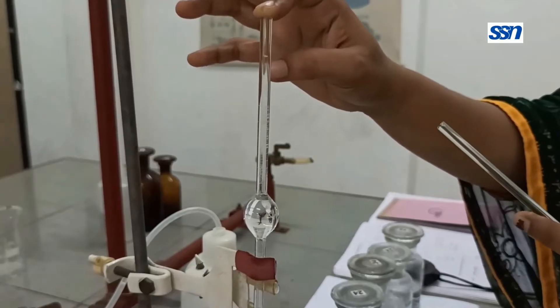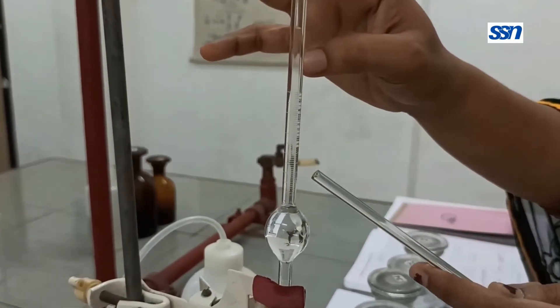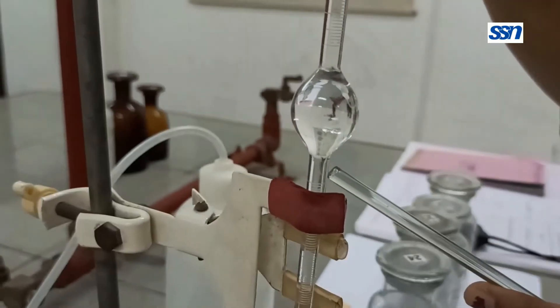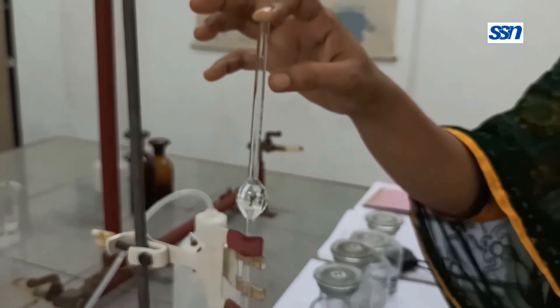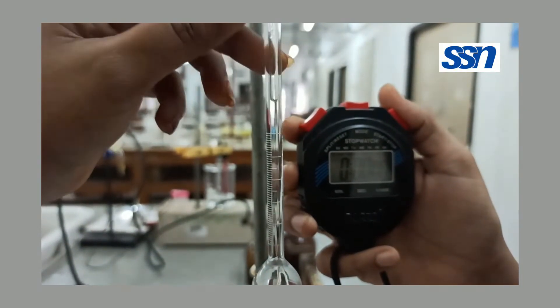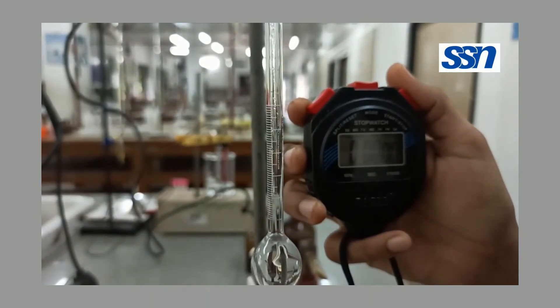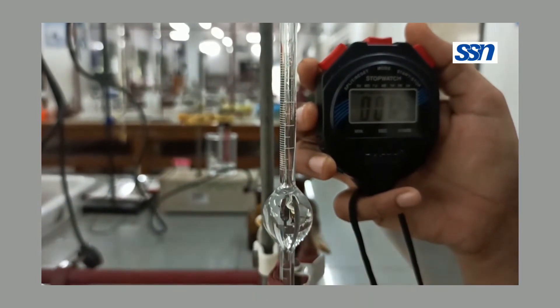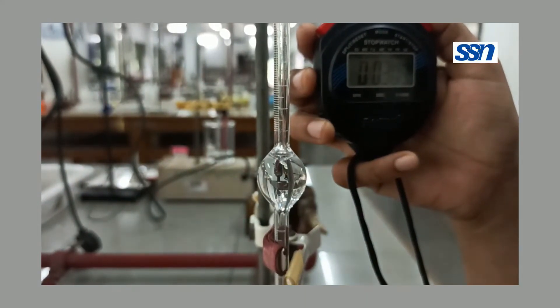Now, slowly release your index finger and the solvent will start flowing through the viscometer. When it comes to the upper mark, start your stopwatch, and when it reaches the lower mark, stop your stopwatch. The following clip will give you a better understanding of this process and how to determine the efflux time T1. The next step is to determine the efflux time for the polymer solutions.